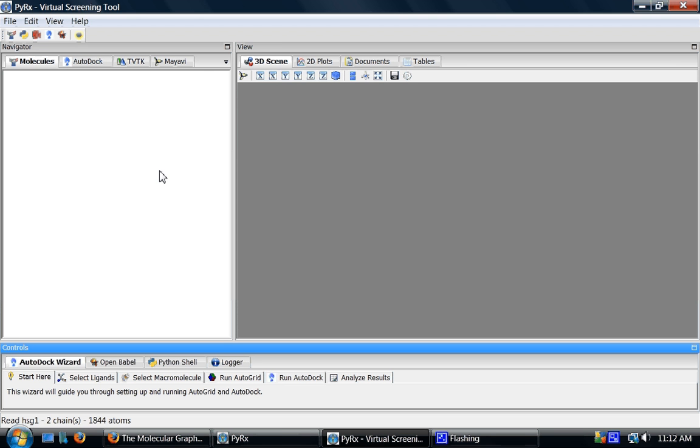Hello, welcome to PyRex screencast. In this screencast I'll show you how to display molecular surfaces.